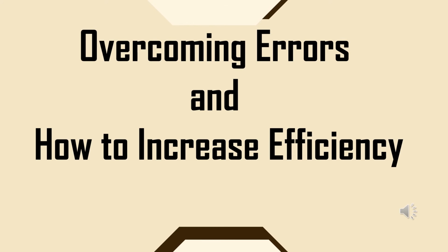for the experiment is that when pouring the sample, a burette should be utilized. In this experiment it wasn't. That's why that might have caused the deviations in the no dilution data, and that is all.